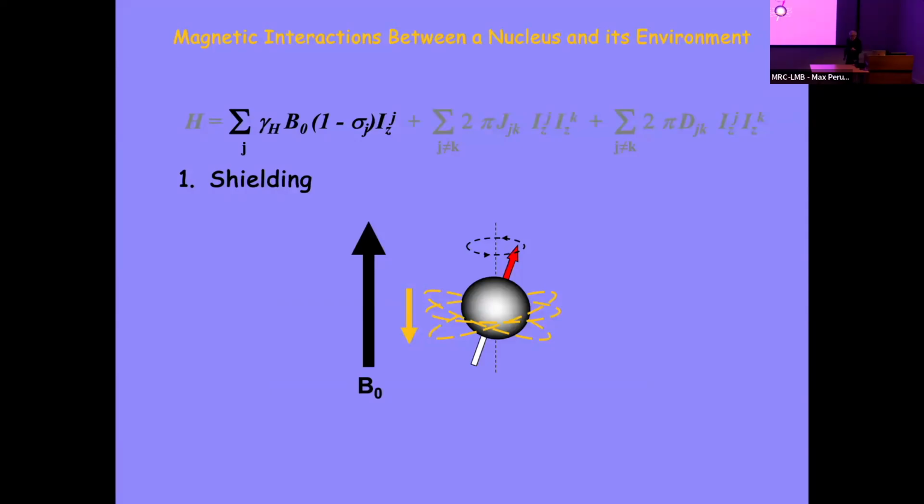So this gives us an enormous amount of information about electron density, so functional group chemistry, and it enables you to ascertain a lot about what the functional group chemistry is within a molecule. But it gives us a single frequency dependent upon the amount of shielding around that particular nucleus. And the chemical shift axis we've already touched upon. The frequency is depicted as chemical shift, which is the frequency normalized against magnetic field strength.